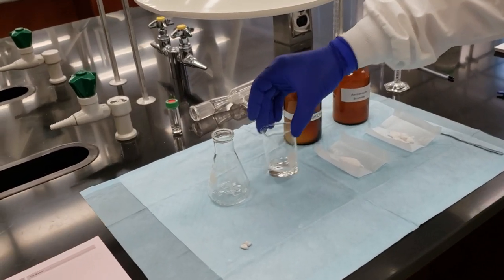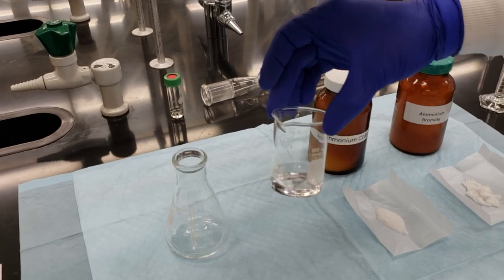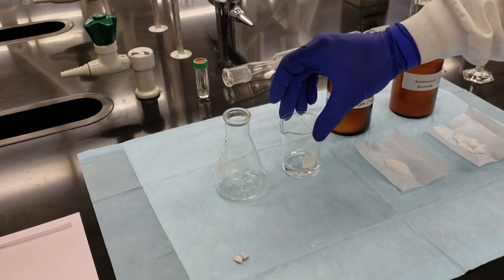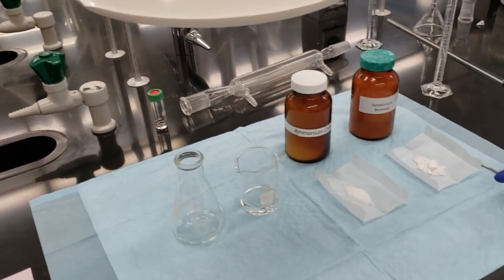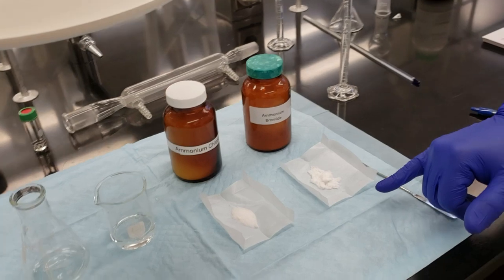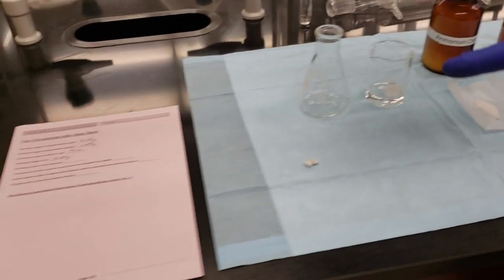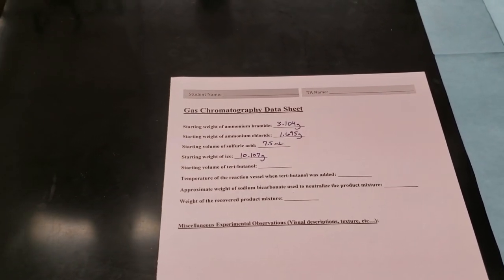So we added our sulfuric acid to our 10 grams of ice. That's a very exothermic reaction. It got very warm, but now everything is mixed together nicely. We've still got it under our snorkel just to be safe. We've weighed out the appropriate amounts of our ammonium chloride and our ammonium bromide, and we've listed our exact weights on our data sheet. So go ahead and take note of that.